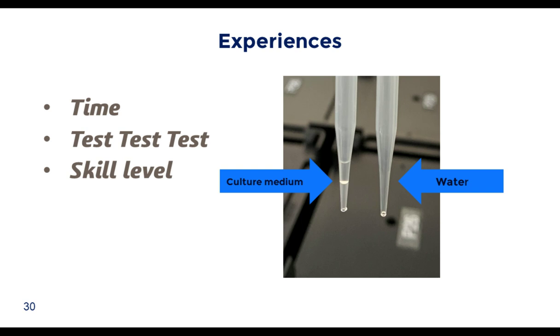Running one or several test campaigns could be helpful, as even after multiple campaigns have been run, you may still be optimizing, finally seeing things that don't occur until real-world conditions are met. Transitioning to the automated workflow too soon could result in timeline delays if the automated workflow fails.